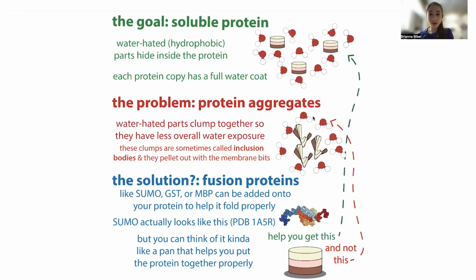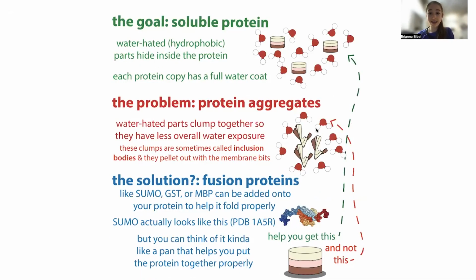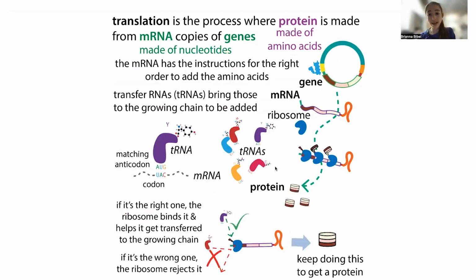And so remember that when I said when something's soluble, each of the copies has a full water coat. And why this happens is because these proteins fold up in a way that puts their hydrophilic, so their water-loved parts, on the outside where they can hang out with water, and then their hydrophobic things, so the things that water avoids, they kind of hide into the center of the protein. The problem is that proteins have these 3D shapes where they're going to hide those hydrophobic parts in the middle, but those hydrophobic parts are not always going to be coming out at the same time. And so as the protein is getting made, as it's getting translated, basically this amino acid chain, this nascent chain, is coming out of the ribosome. And as it's coming out, it has to fold.